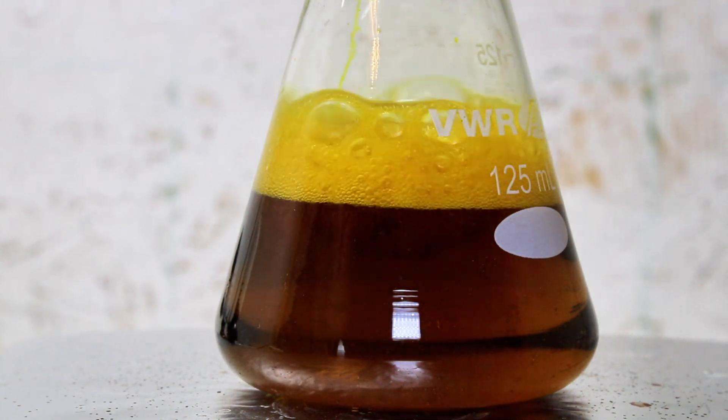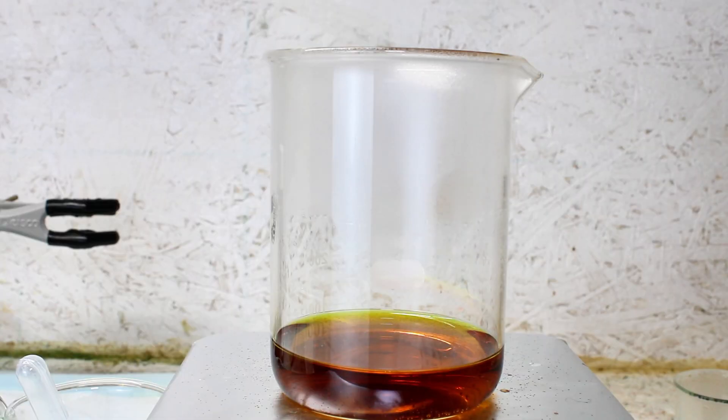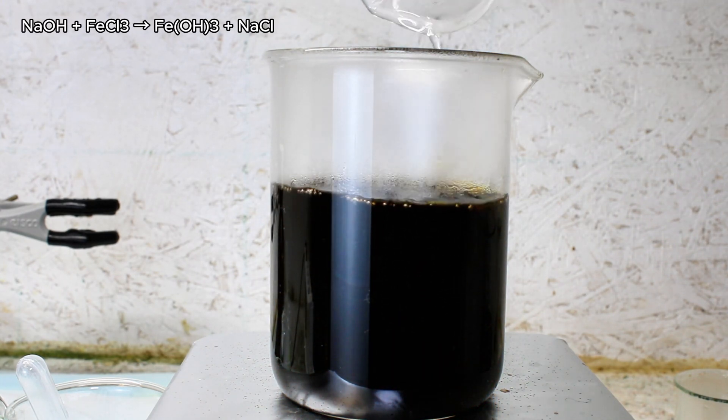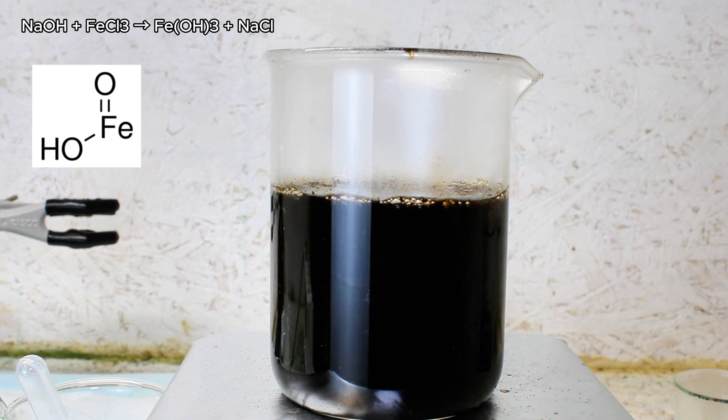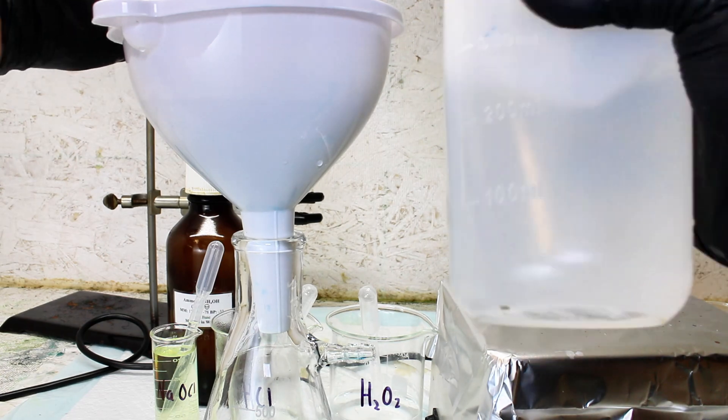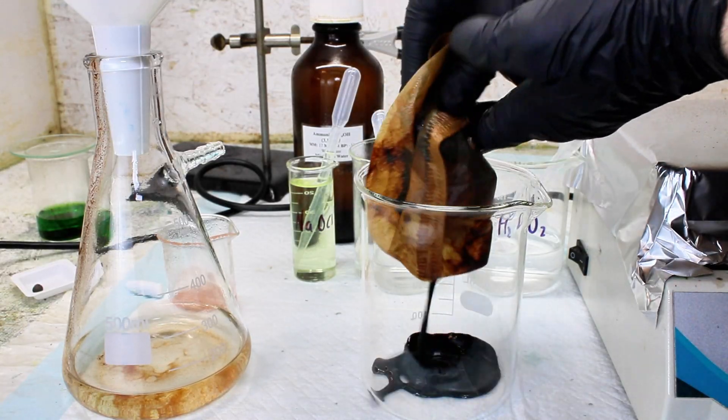Next, I go ahead and pour my iron(III) chloride solution into a beaker and add some 2 molar sodium hydroxide to form the insoluble iron(III) hydroxide, which is a dark brown solid that's sometimes used to treat iron deficiency. This is then transferred to another beaker once most of the water is filtered off.